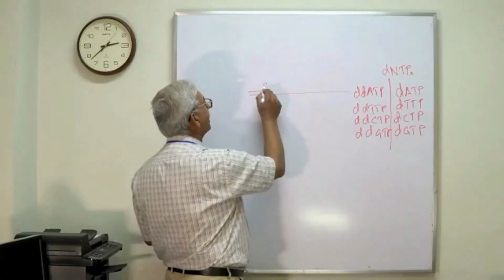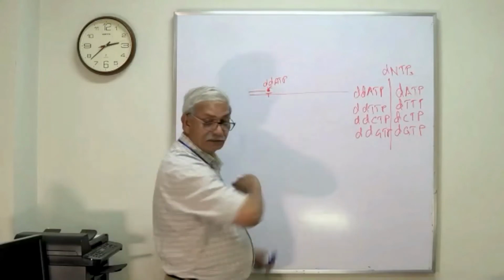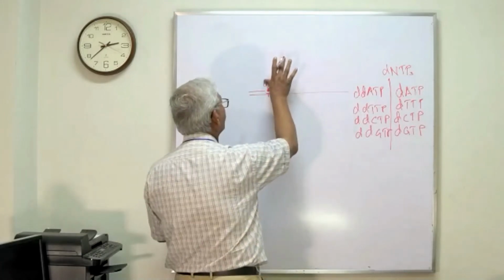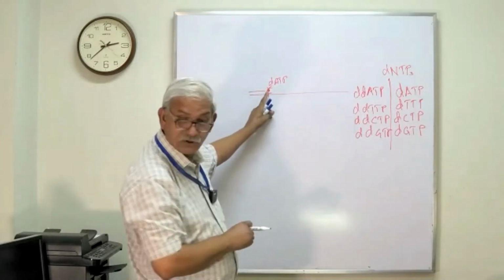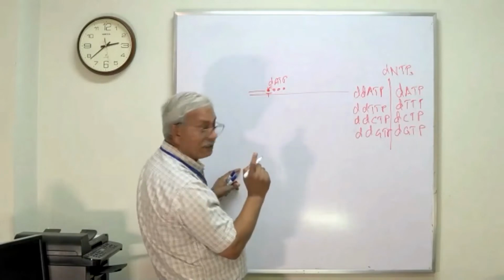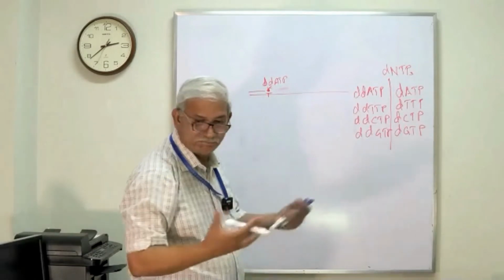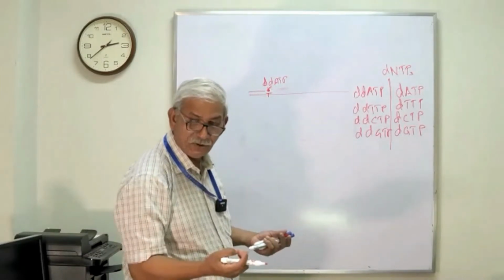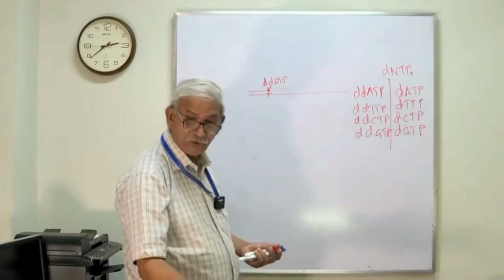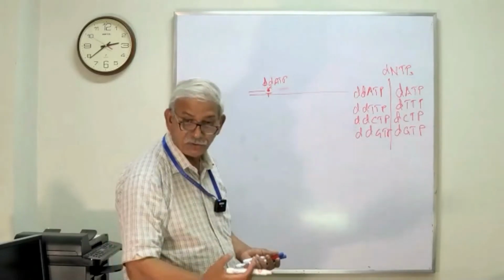So this may be dideoxy ATP, which is being added here, right? Okay. Alternatively, it can be a deoxynucleotide. If there is a deoxynucleotide added here, the chain will keep on growing. But if there is a dideoxynucleotide here, the chain will not grow because it has a hydrogen group at carbon position number 3, and the hydroxyl group is not available for phosphodiester bond formation with carbon position number 5 at the coming nucleotide.